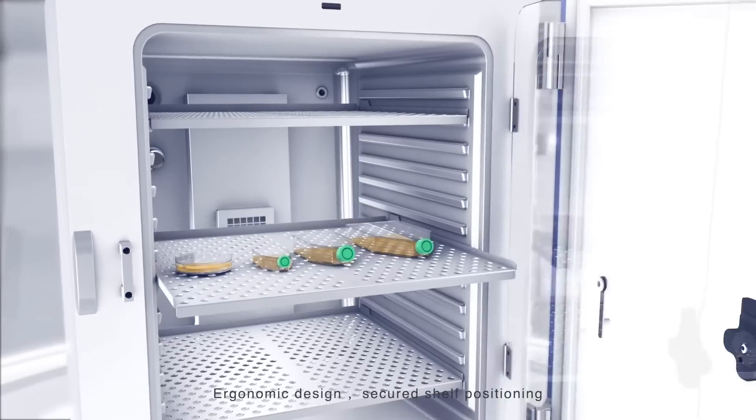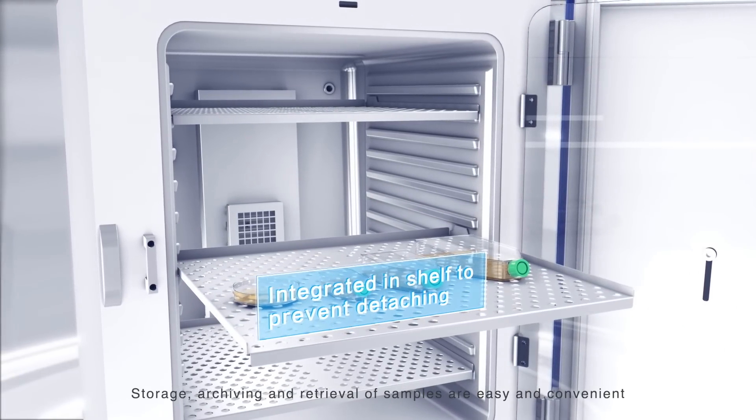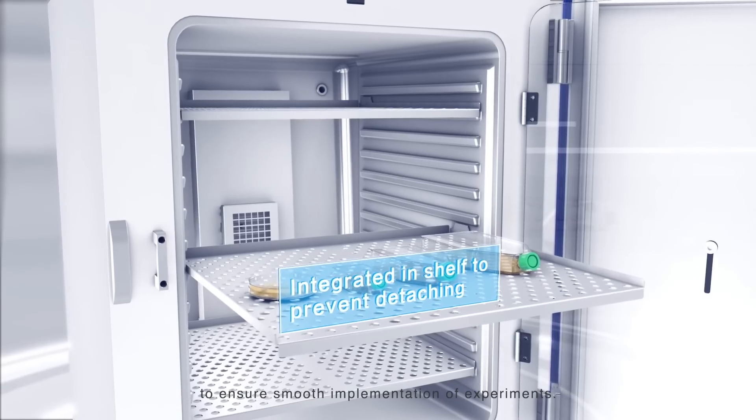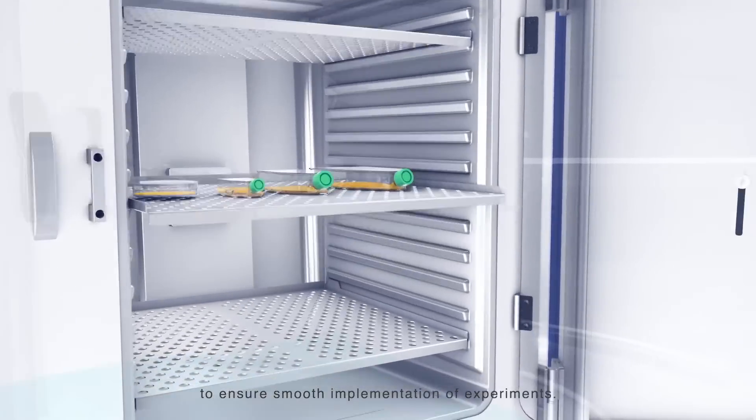Ergonomic design. Secured shelf positioning. Storage, archiving, and retrieval of samples are easy and convenient to ensure smooth implementation of experiments.